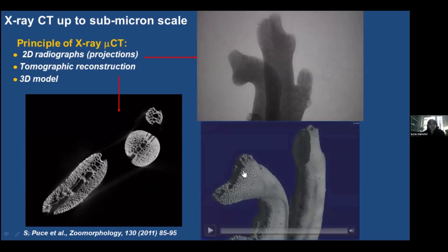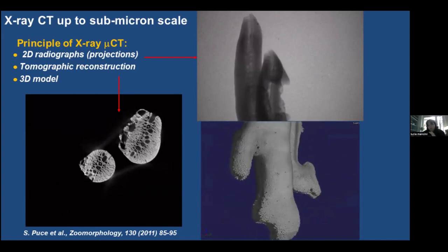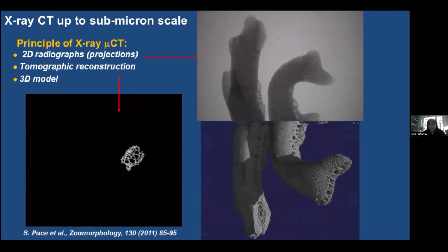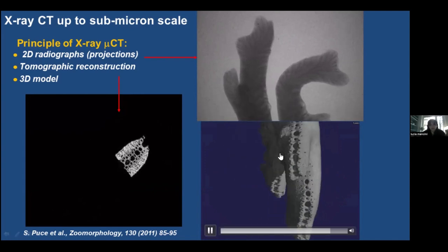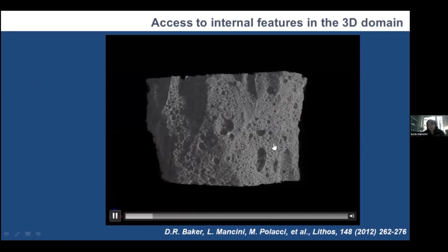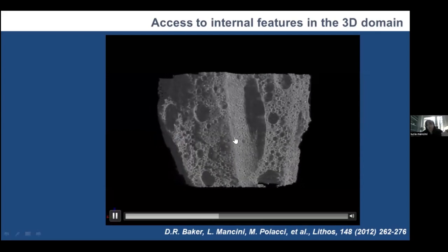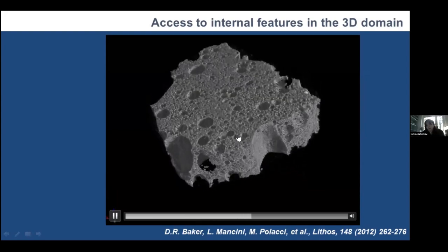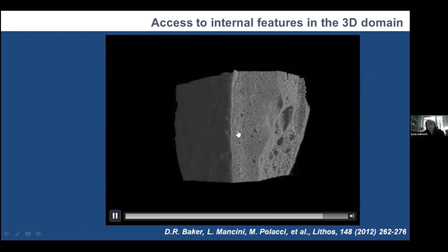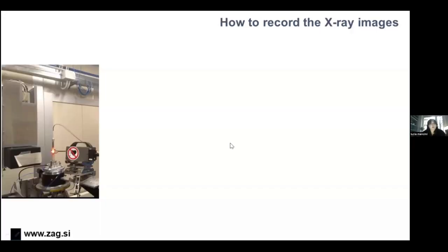And after that, you can obtain a virtual model of your sample, allowing you to see it in a visualization that is typically called 3D rendering or volume rendering, as in this case. This is a coral, a hydrocoral from a museum. But it is also possible to visualize the object not only as a whole. Once you have the volumetric reconstruction, you can cut or crop your object in all the different directions of space and analyze how the different parts inside are distributed, and determine their size and distance and so on.